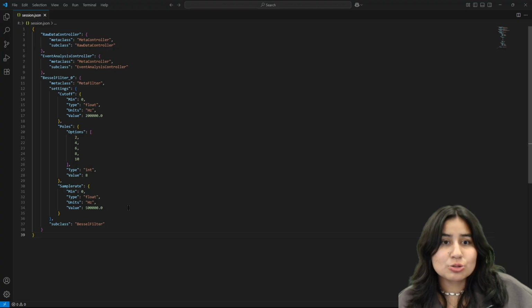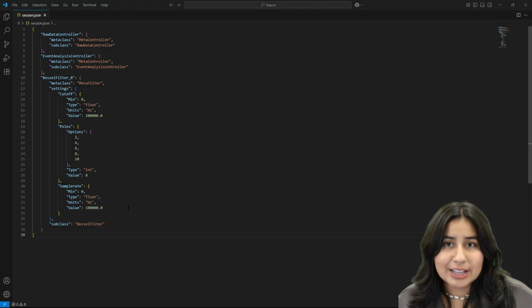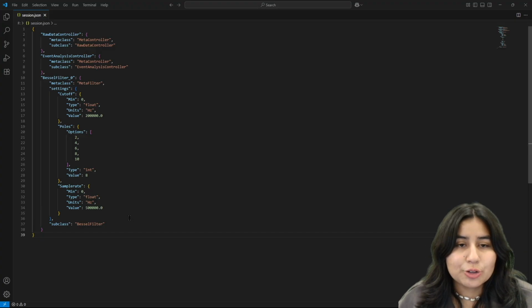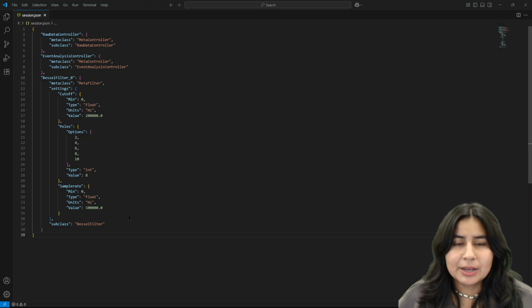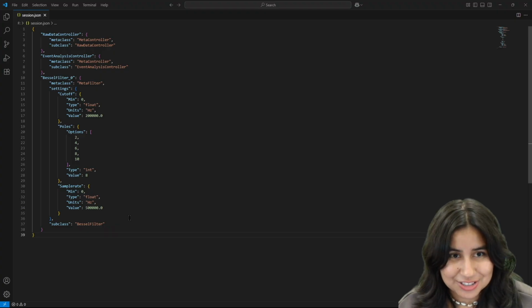Another tip is to name your session files. I just did it for reference. I named it tutorial, but you should name it with descriptive file names, and it's really good to include the timestamp. That is really helpful. Another important thing is that you should try to keep your sessions dedicated, as having multiple tasks that are unrelated in the same session makes the session cumbersome, and Poriscope works best with like sessions.